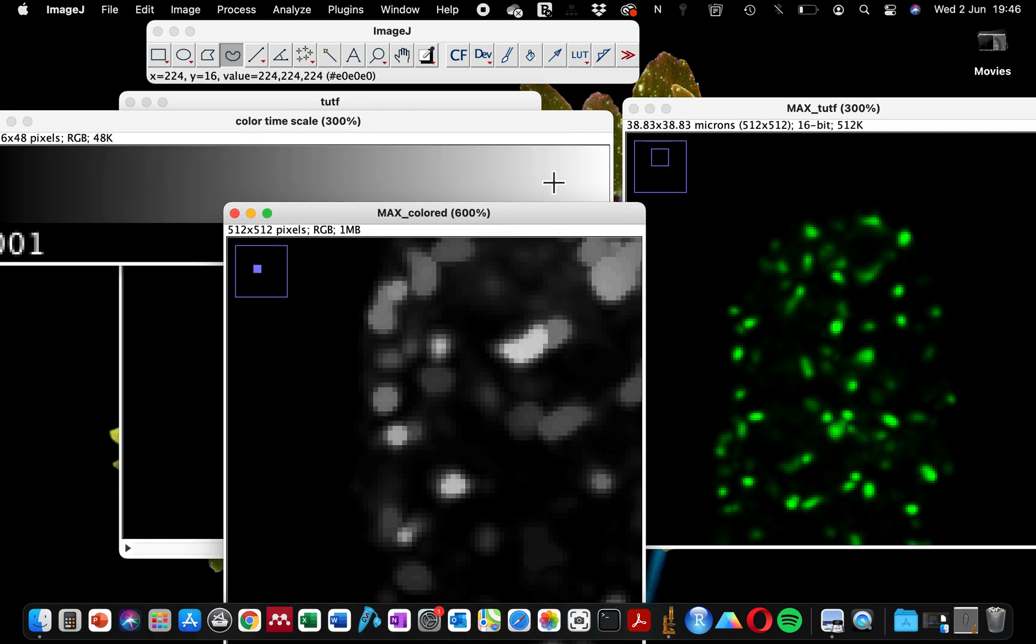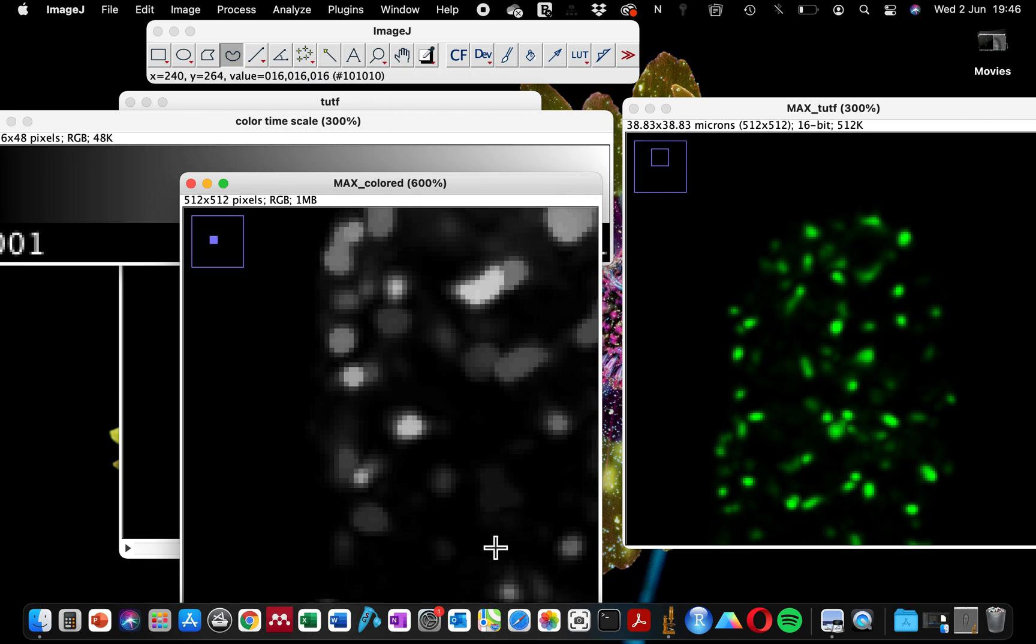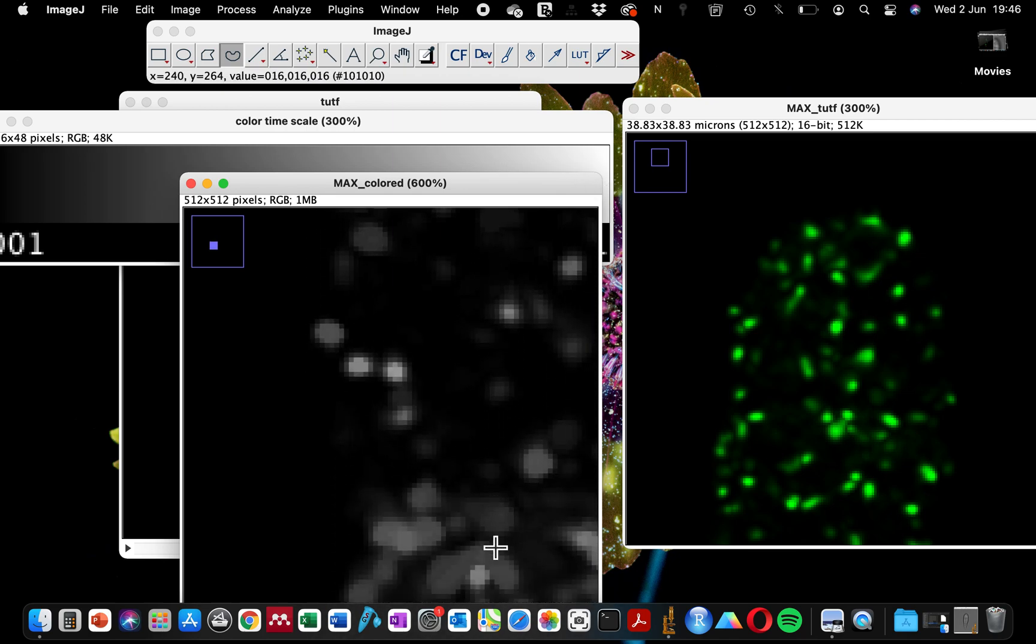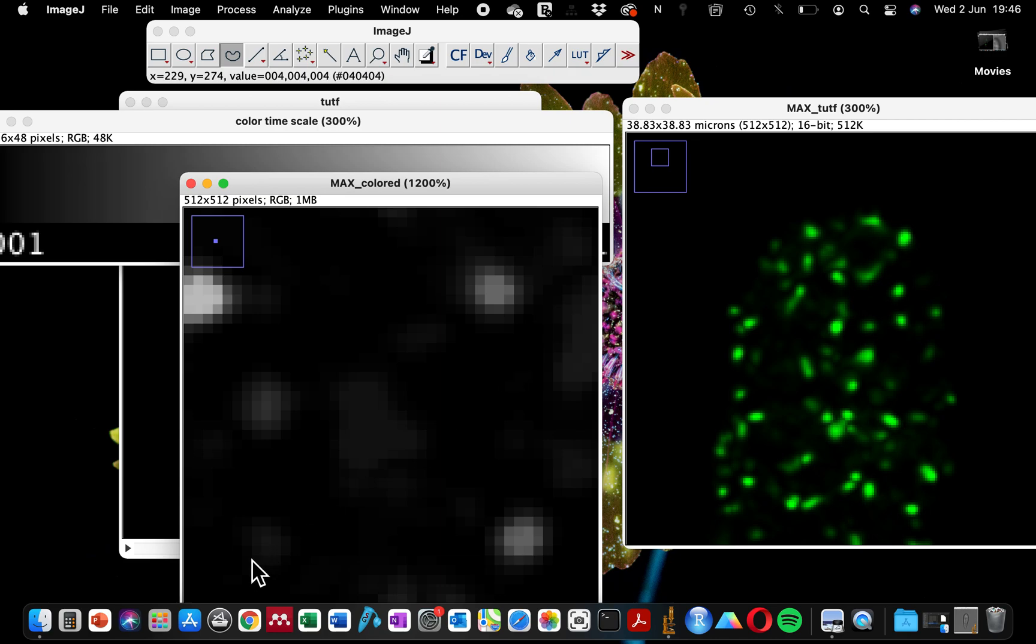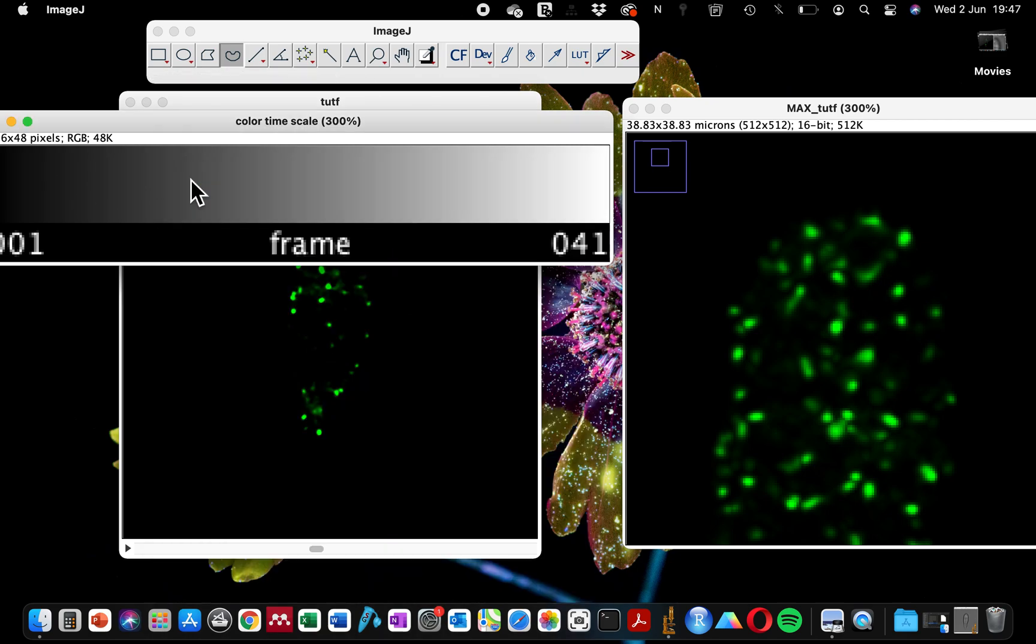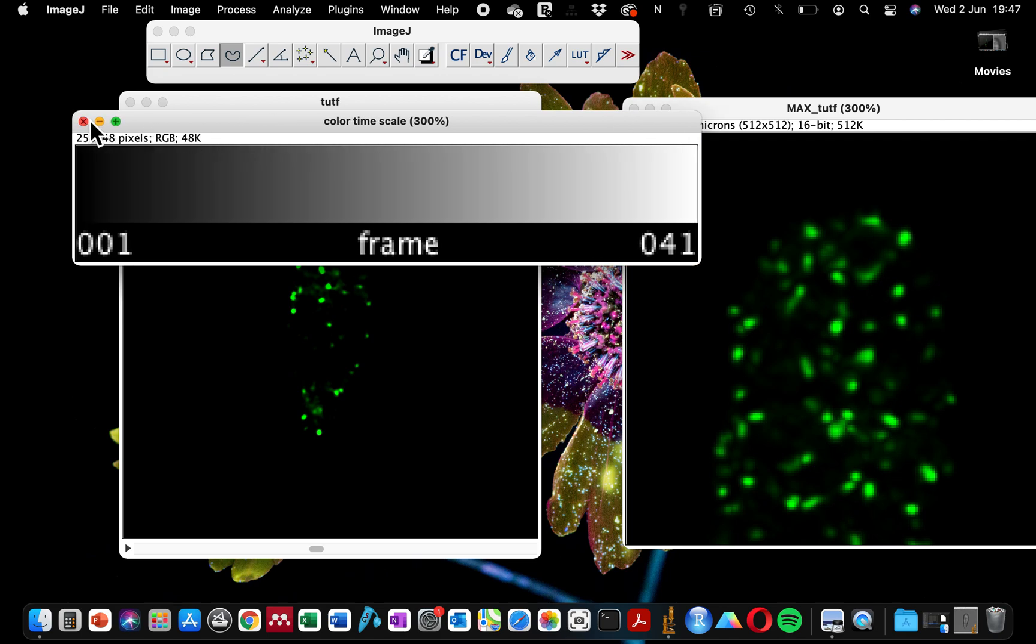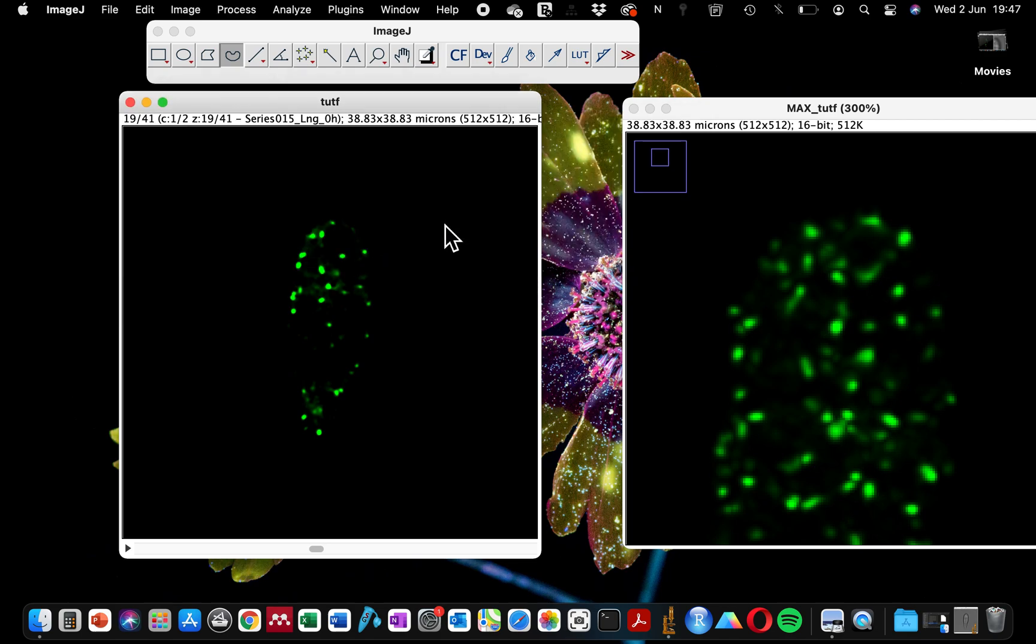The white ones are closer to the base of the image, but you can easily lose your audience because like this one that is showing a bit in between dark and white, it's difficult to see the actual image. So it's not advisable to choose gray scale for your scale bar.